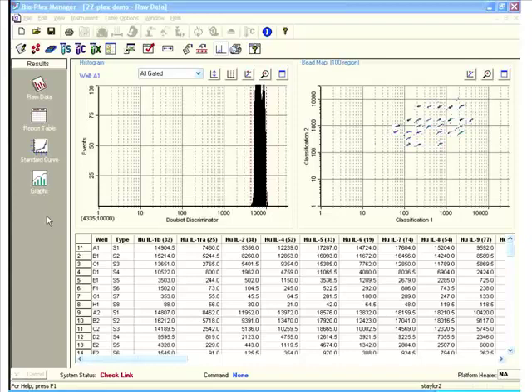Hello, everyone. This is Sean Taylor, a field application scientist with BioRad Canada. I'm going to talk to you about BioPlex Manager, which is the software that BioRad has developed to not only operate a Luminex 200 system, but also to integrate the data analysis in the same software. In a previous video, I showed you how to operate the system and load the plate, and now in this video training, I'm going to show you how to use BioPlex Manager to analyze the associated data from a HiPlex assay.